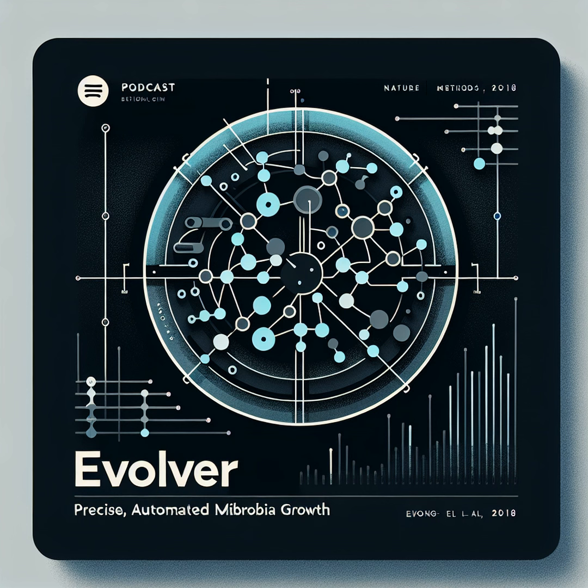So, the system's modularity, the sophisticated fluidic controls, and the powerful programmable control system all come together to address the original challenge of balancing high throughput and precise control. Now that we've explored the nuts and bolts of eVOLVER, let's delve into the impressive applications and implications of this technology in the wider field of autonomous science.